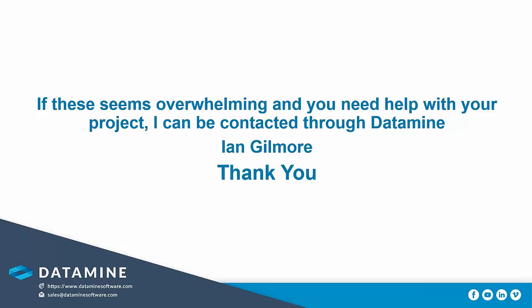Question from the floor was, how do you deal with delivery supply on time? I don't get involved in that. I recommend certain instrumentation, certain equipment, and the rest is up to them. But one of the things I do include is an Excel spreadsheet with the plant, an equipment list and a list of consumables, and any particular data like treatment plants for sewage and for the outfall in the lab, put on a spreadsheet.